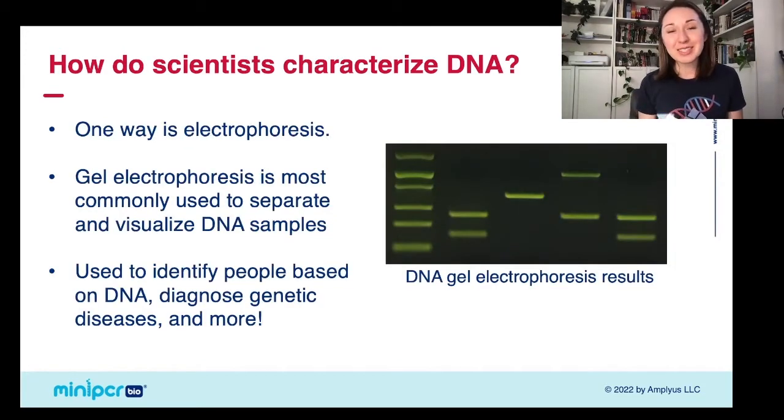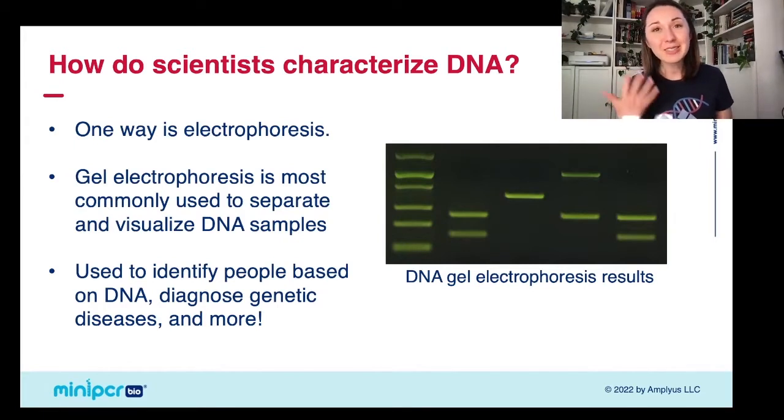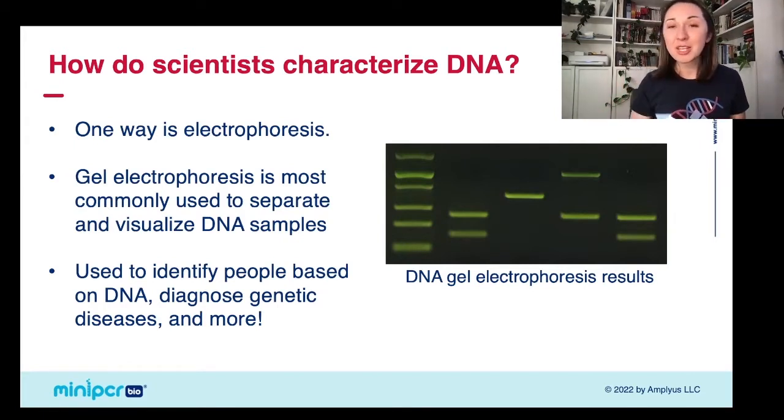So one of the reasons why we're doing this today is because we want to make something called gel electrophoresis more accessible for students. So if you're familiar with DNA, if you're familiar with gel electrophoresis, you might have seen an image like this of horizontal bands on a gel. So gel electrophoresis is a really important tool to be able to separate and characterize DNA molecules.